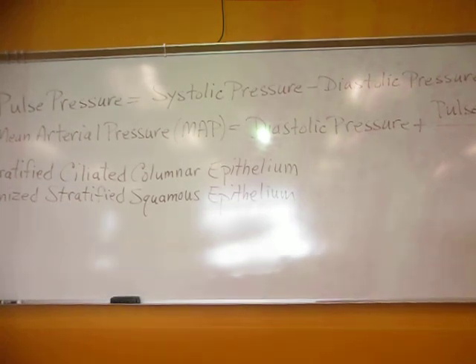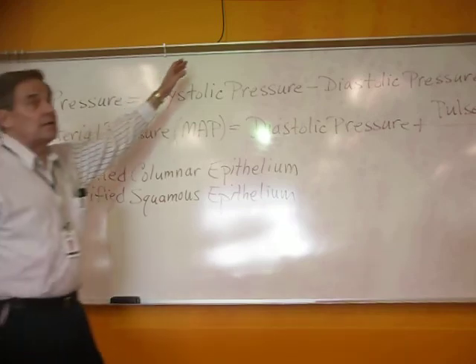Sections of the tracheal wall, a section of the trachea, and a section of the lungs. Normal lungs only. There's some fibrosis and so on, but you don't need to worry about that. I want you to know the structure of the normal lung. What you're going to be looking for there are respiratory passages and blood vessels. You should be able to distinguish blood vessels. Remember, the lungs are highly vascularized, with lots of blood flow.